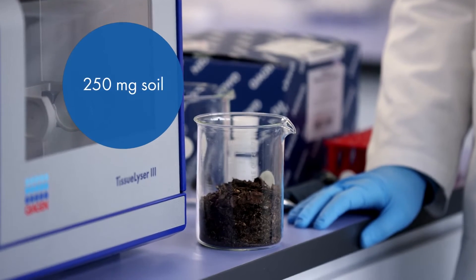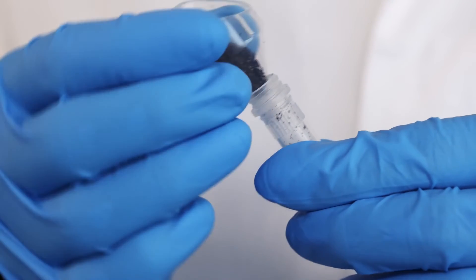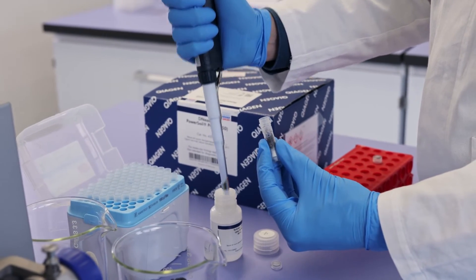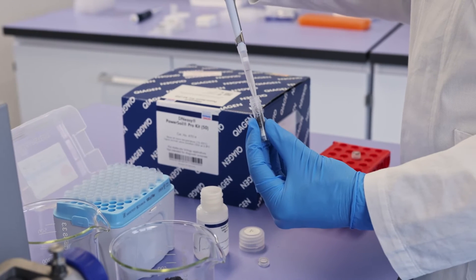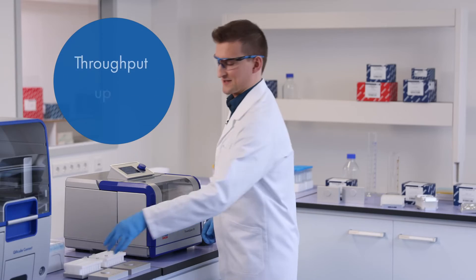I've weighed 250 milligrams of soil, which I am pouring into a PowerBeat Pro tube from the DN-Easy PowerSoil Pro Kit. Now I am adding lysis buffer to the tube. You can choose from different adapters depending on your needs.